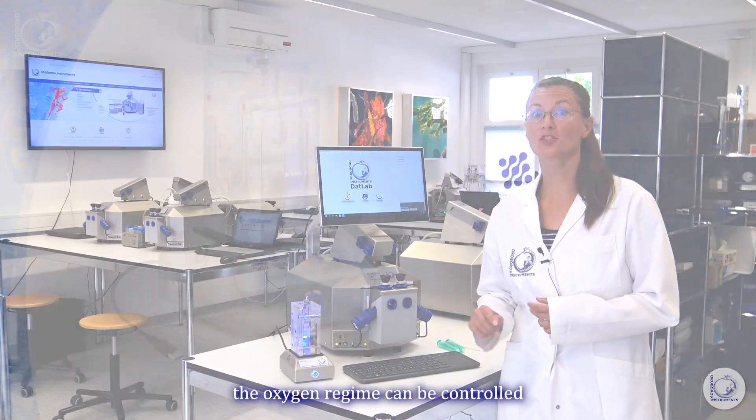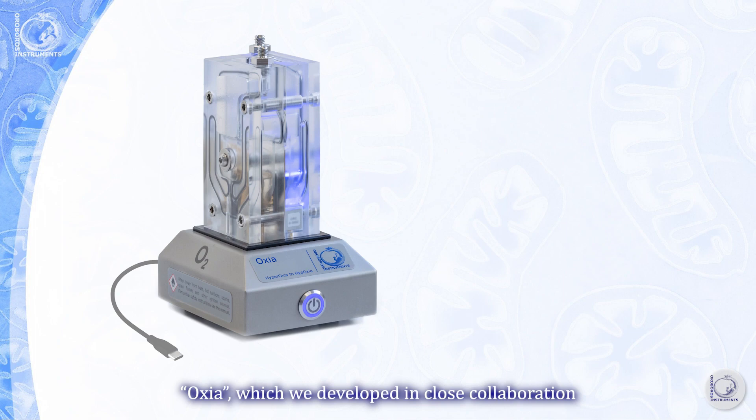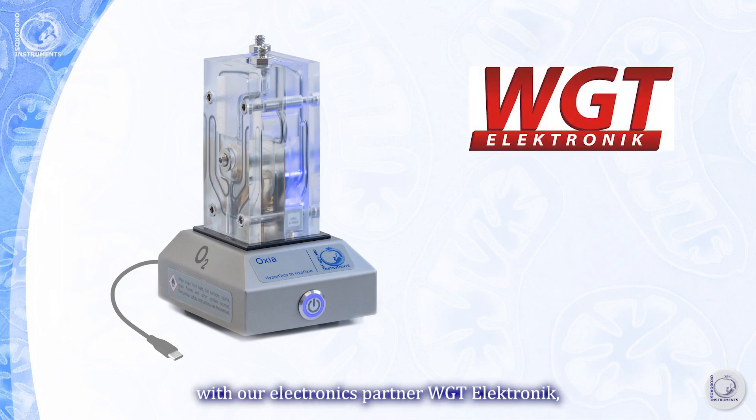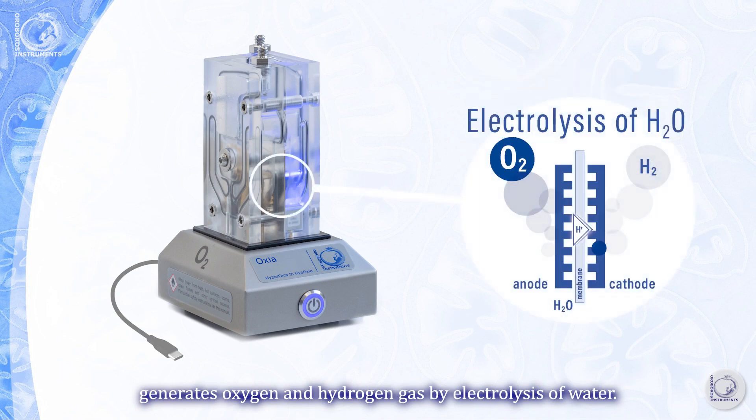With Oxia, the oxygen regime can be controlled in the experimental chamber of the O2K using oxygen and hydrogen gas. Oxia, which we developed in close collaboration with our electronics partner WGT-Electronic, generates oxygen and hydrogen gas by electrolysis of water.